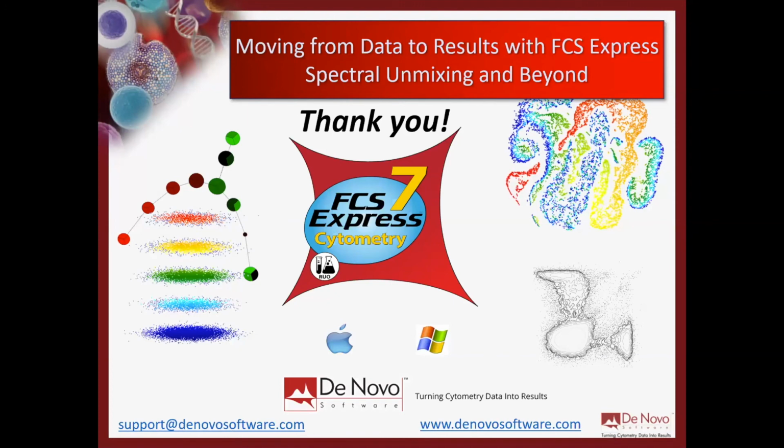Rohit asked, is there a better unmixing algorithm to analyze dim expressed markers? Well, we only offer one unmixing algorithm, so that's your choice. You have one choice. We make the choice simple. We're actively looking at other algorithms, and I think we'll be able to answer that question more accurately once we implement some of these other algorithms and can do some comparisons side by side. So I'm not sure, but again, right now you have one, so you can check that out.